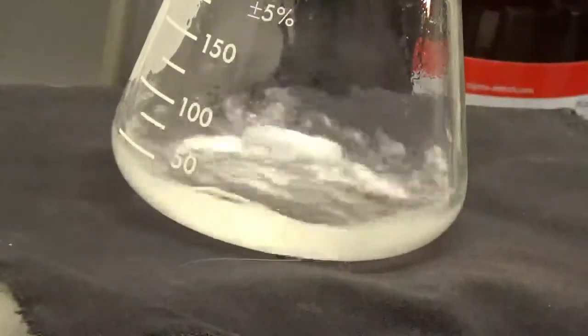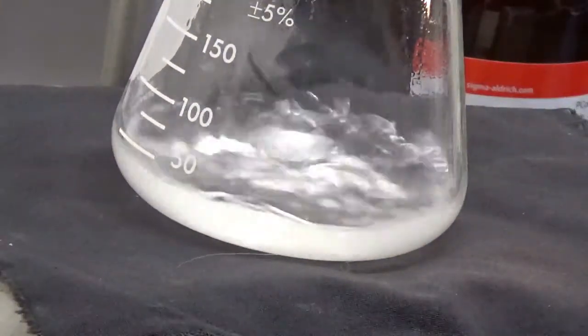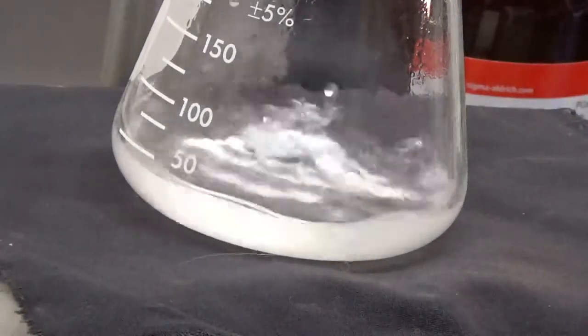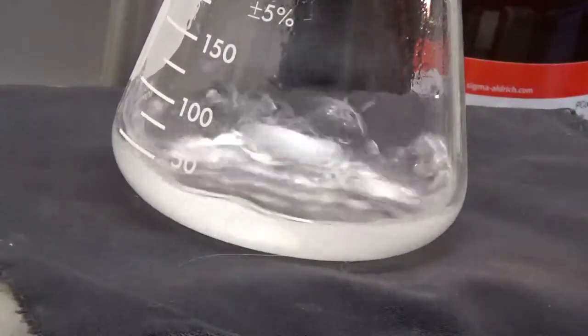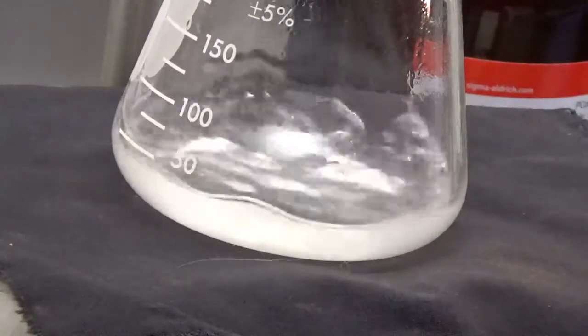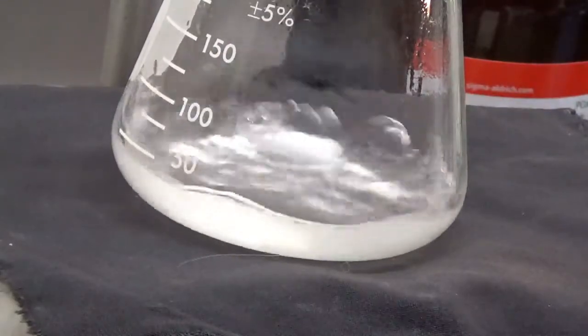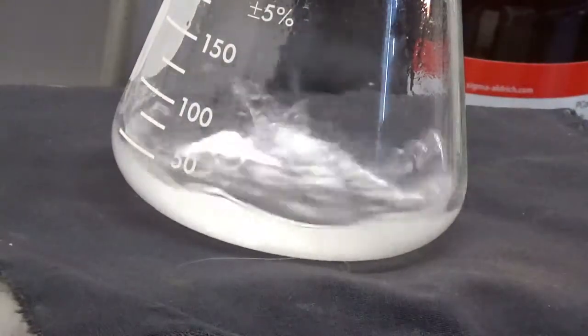Take that reading just to have it, and then see if it really is done. So that looks like it's 0.93 milliliters. I'll just write that down.